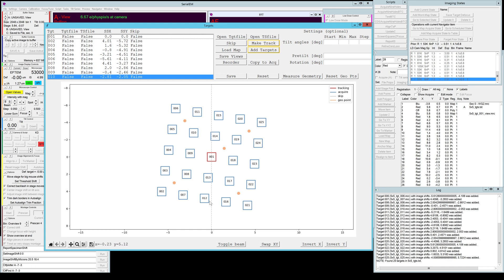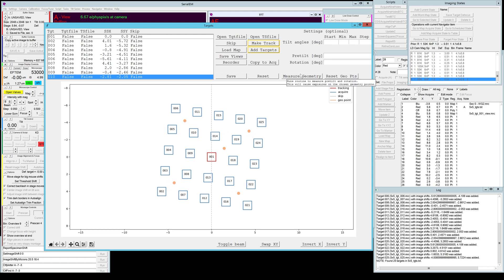What you can also see is that there are some orange points, those are the geo points. Those are automatically determined depending on your grid pattern and your vectors and you can use those to measure the geometry of your sample support.